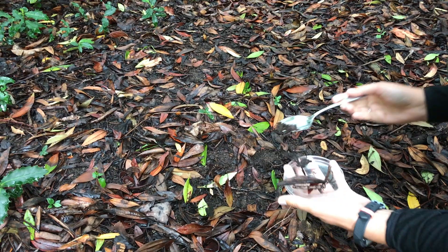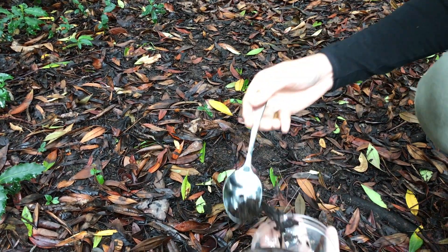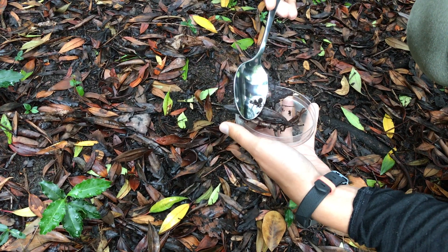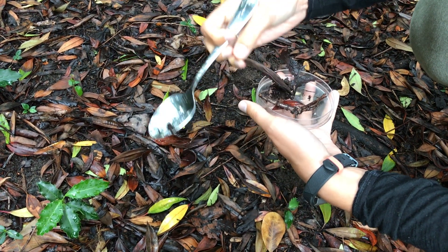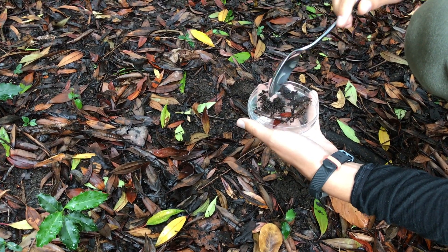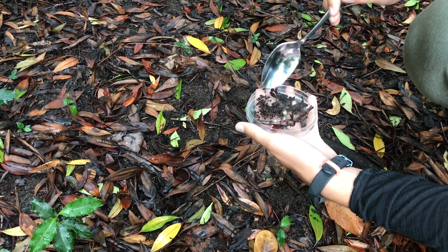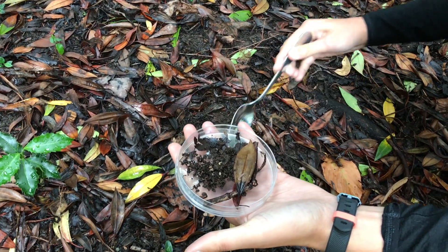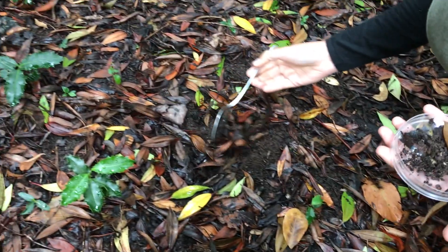Move just the top layer of plant material and soil around when looking for macroinvertebrates. There's no need to dig. Make sure nothing is hanging out of the dish, and make sure to put anything you moved out of the way back to where it was.